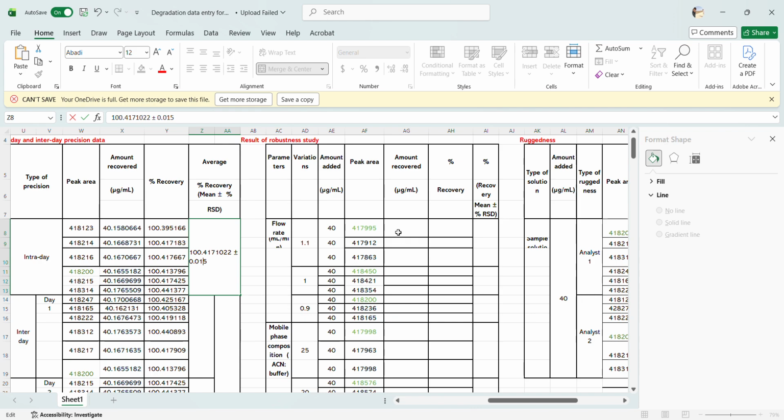Okay, so this is the same procedure. What will you do? We'll just copy paste this. Okay, sorry. I've just copy pasted this, just put equal to and paste, and our initial value is 40 because our nominal concentration was 40, and for this reason we are using this. After the calculation we have got this, then after that we'll use the percent recovery.